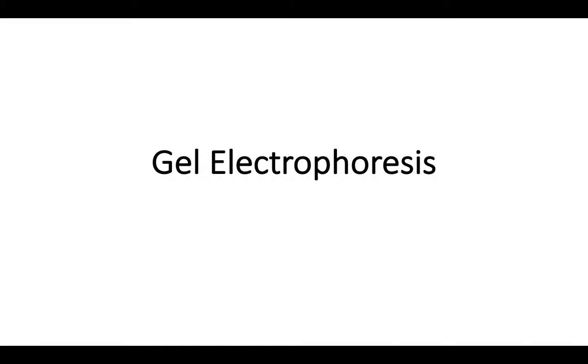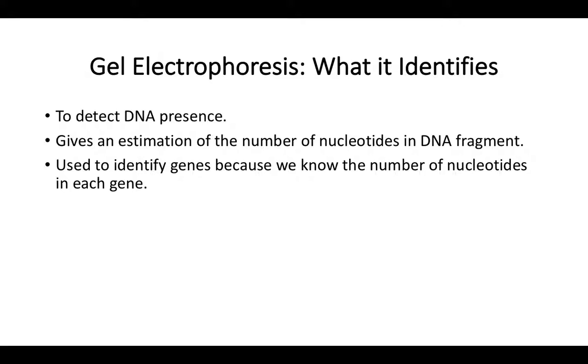Hello everyone. Today we're going to discuss gel electrophoresis. It's an extension of last week's lab, which was an extension of the week before that. So in the first week, we did primer analysis, where we identified two primers that we're going to use for polymerase chain reaction, which was used to amplify 4 samples.